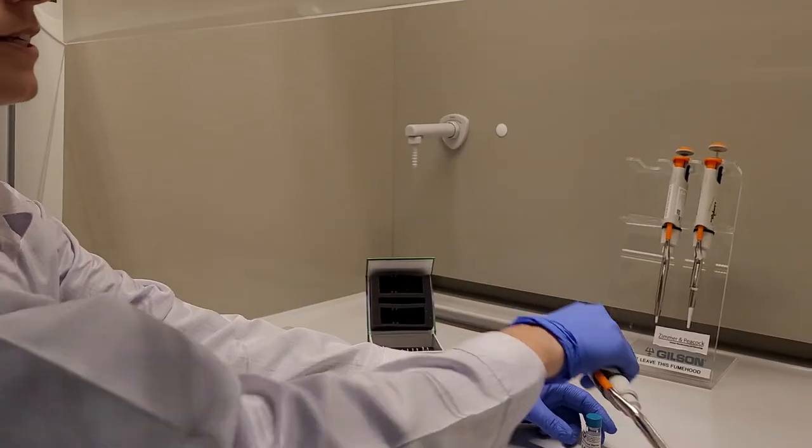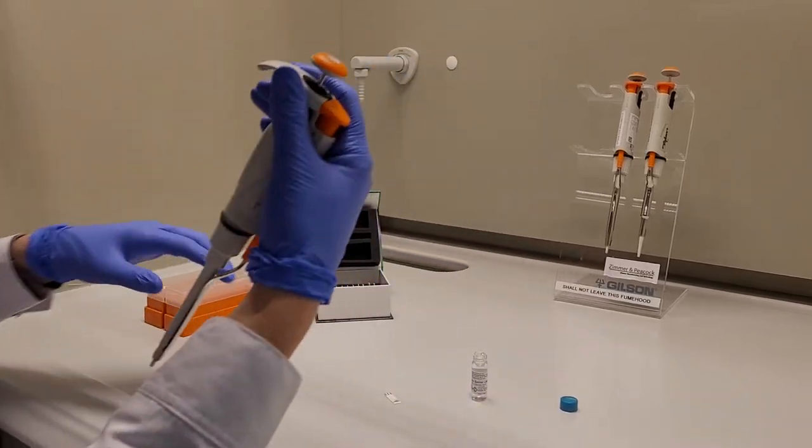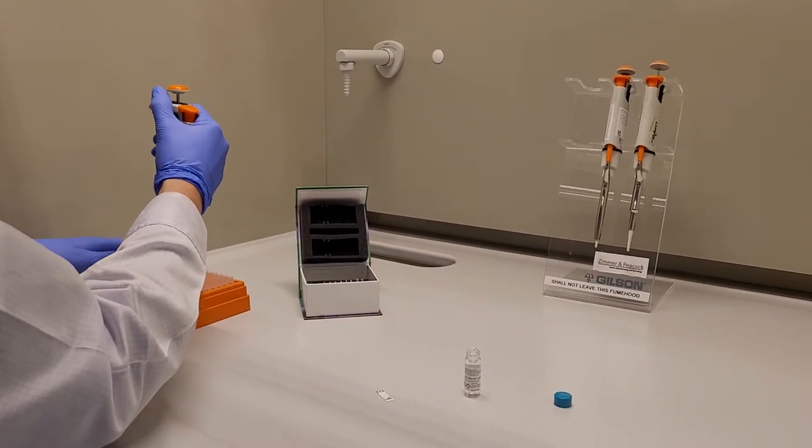We'll pipette 0.6 microliter onto the working electrode and so we'll set our pipette to that.